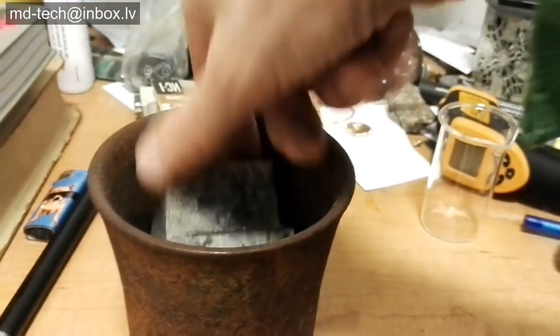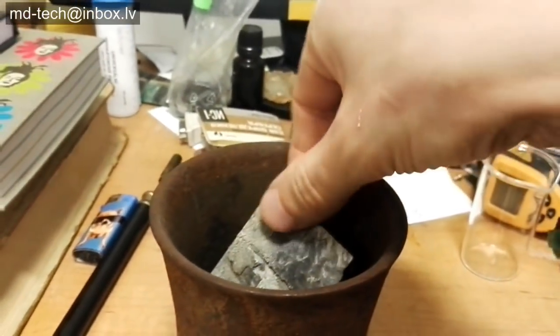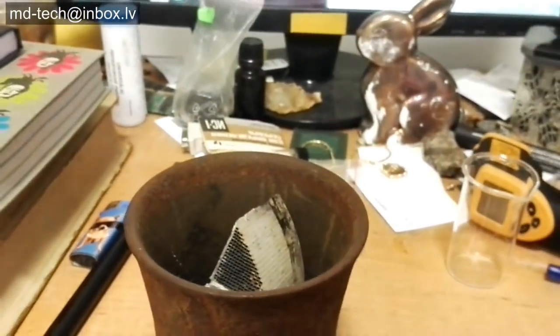You need to grind the converter to 150 mesh. The inner surface of the converter is laminated, and this laminate after heating up to 600 degrees opens the pores.